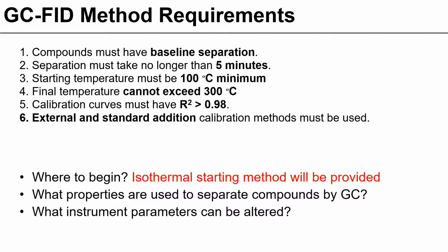And hopefully the first thing that pops into your mind is, we're ramping the temperature here. We're separating the compounds based on their boiling point, right? When they go into the gas phase and start traveling through the column.